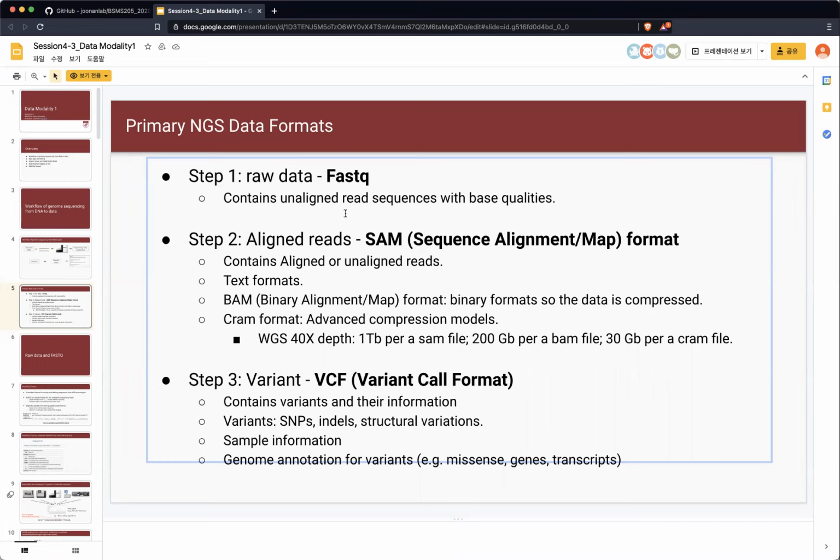Disk space takes money, right? So you want to store it in a much handier and lighter way, so you can save the cost of analysis and the cost of storage, right? Cost saving is a critical part of industry and research as well. So you want to use binary for sequence information.